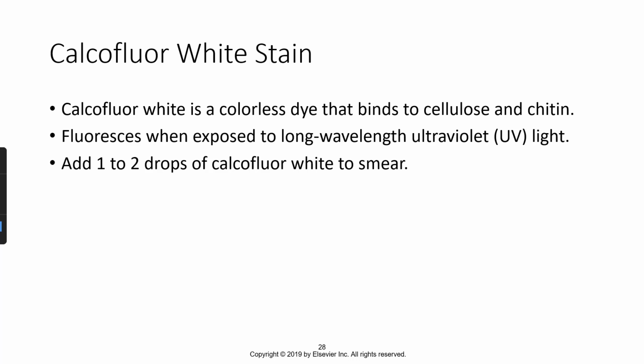It fluoresces when it's exposed to long wavelength ultraviolet light. So you add a couple drops to the smear and then turn on the UV light. Or you can add it, let it sit, rinse it off, turn on the UV light and see if you see any fungal elements on there.